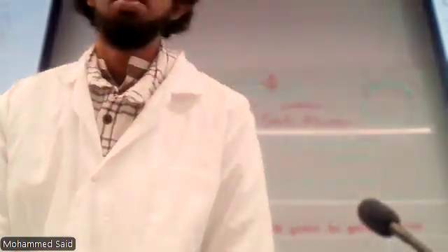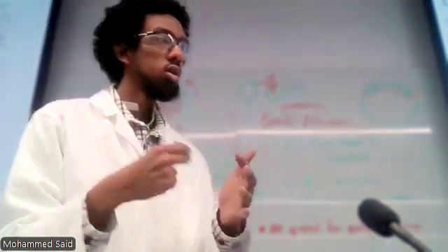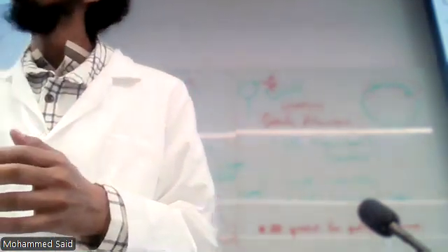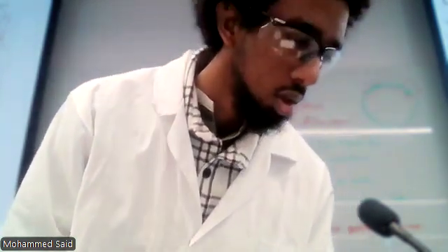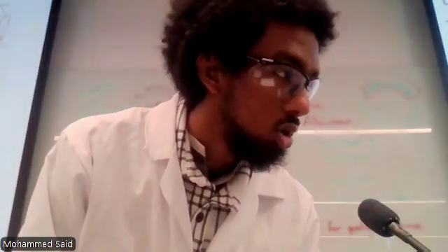Now the plaque assay is on your benches. The materials include a lambda, right? That's your lambda phage, and E. coli, which you also have here. I just want everyone to pay close attention. Besides the plaque assay, whenever you're dealing with bacterium, make sure once again you resuspend. Continually make sure that you resuspend your bacterium, so that way, especially in conjugation, you don't run the risk of essentially having minimal bacteria to work with.